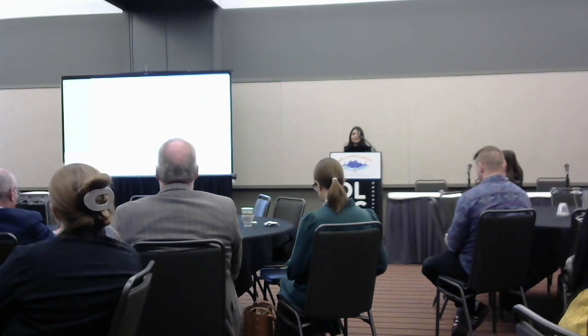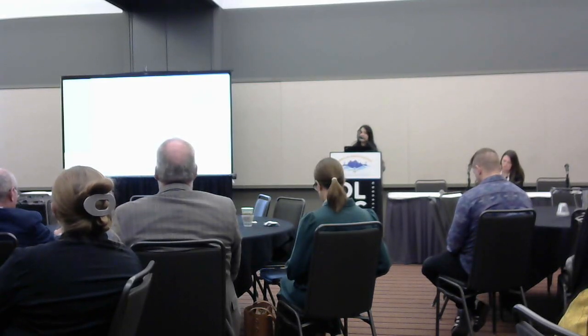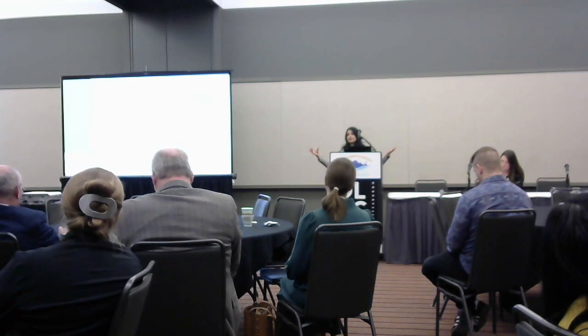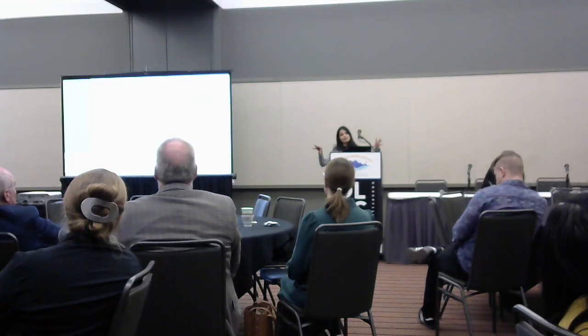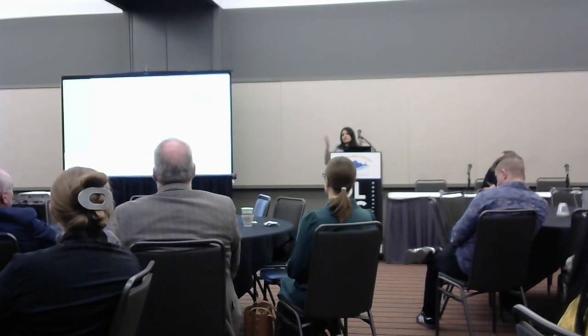So Nikon, if you have used any Nikon instrument, if you have used the Nikon Elements, they also have a server license where you can actually have an on-premises Windows cluster. So for example, the 2 workstations that I mentioned that we have, we can use them as 2 nodes. And I just have to get a server license for the NIS-Elements that we currently have, maybe have an additional seat.